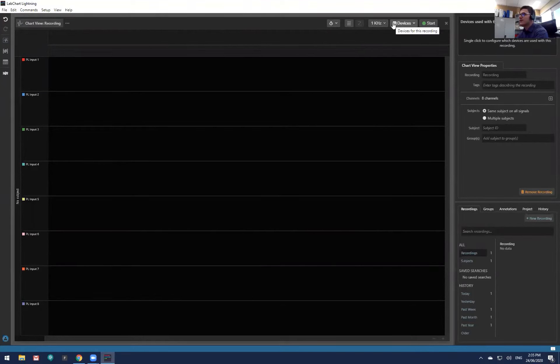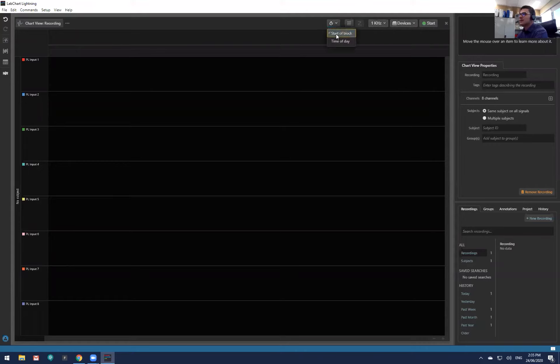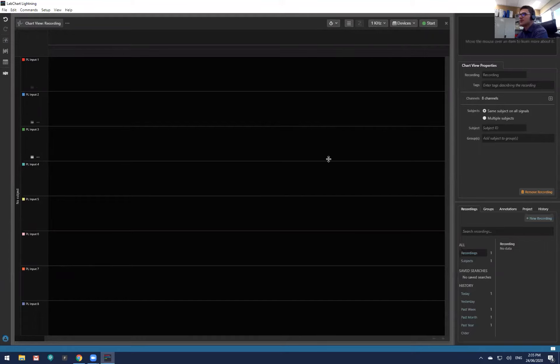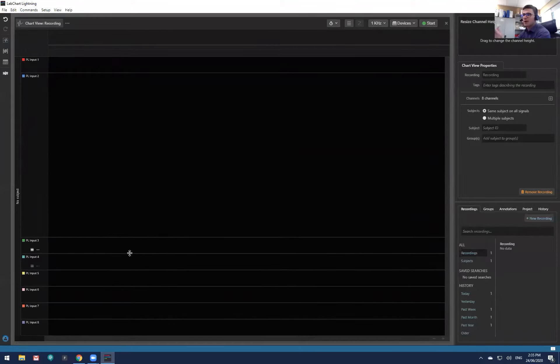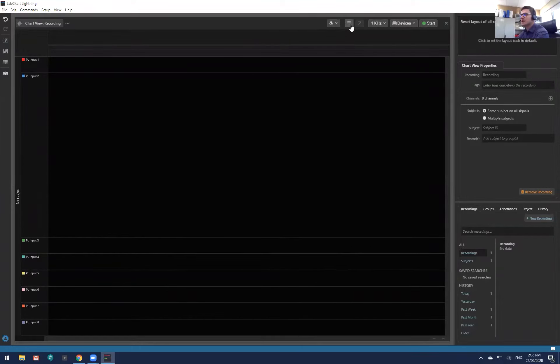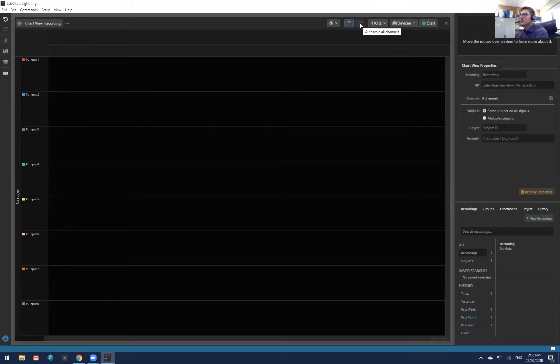Anywhere you move your cursor, a pop-up will briefly tell you what you can do with each option. Up in the top right you have your start time, start block, and date. You also have a Reset Layout option — if your layout is arranged a certain way and you want to reset it, you can do that here.